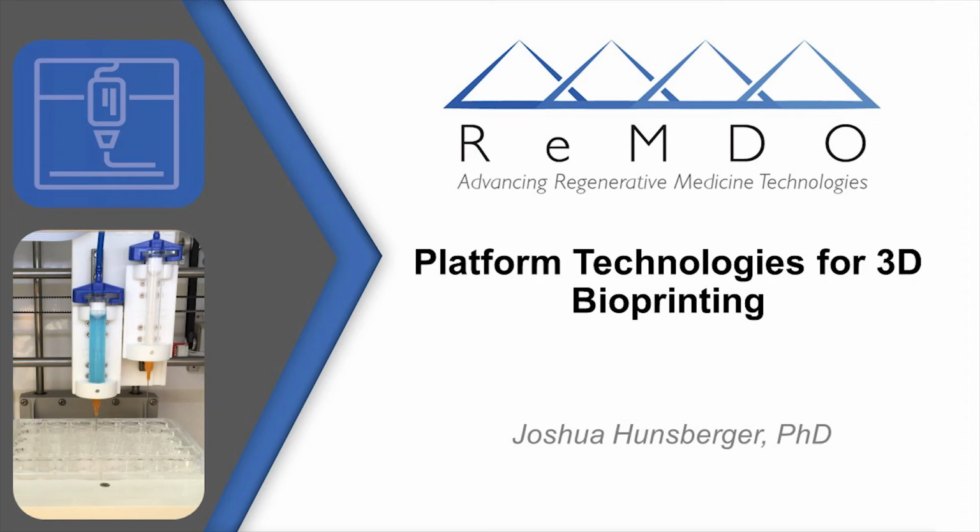And so I'll be starting off talking about some platform technologies to support 3D bioprinting. And this is work that's being done by RegenMed Development Organization. It's a nonprofit organization that is advancing a tunable bioink system. And that's what I'll be covering today. But we thought this would be a good talk to sort of set the stage for the rest of this session.